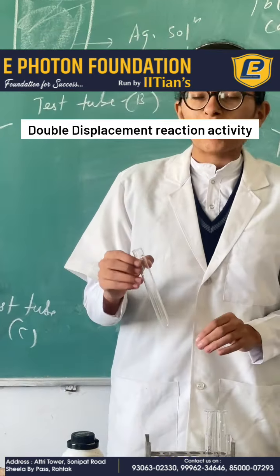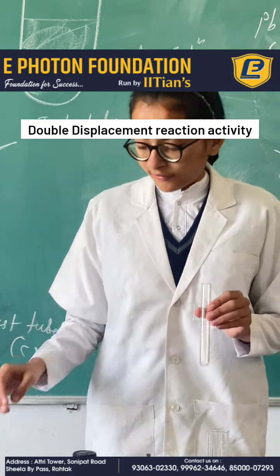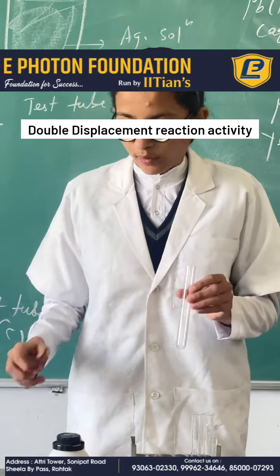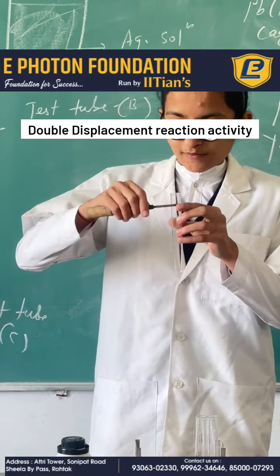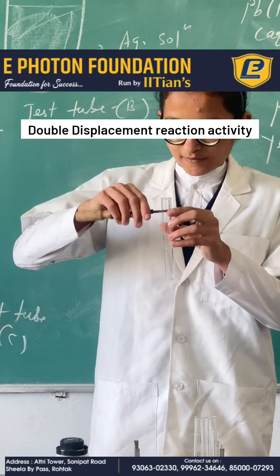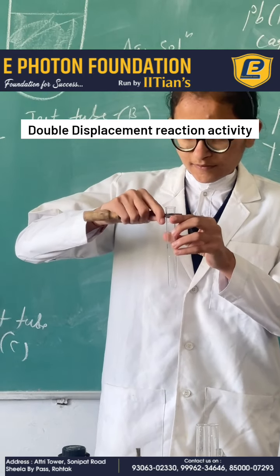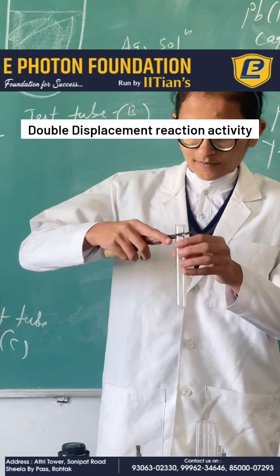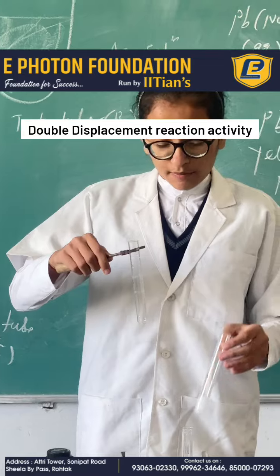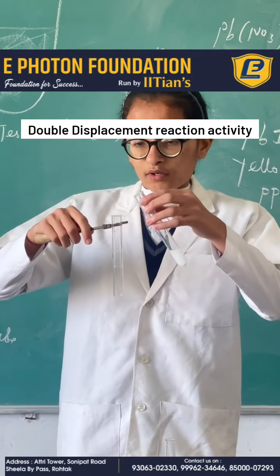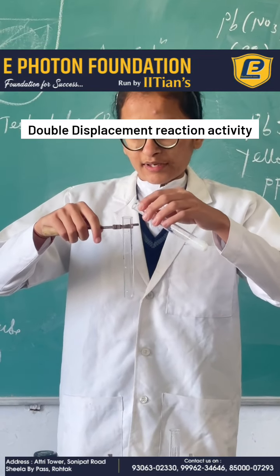Now take another test tube C and hold it with the help of a test tube holder. Now add some amount of potassium iodide. Thank you.